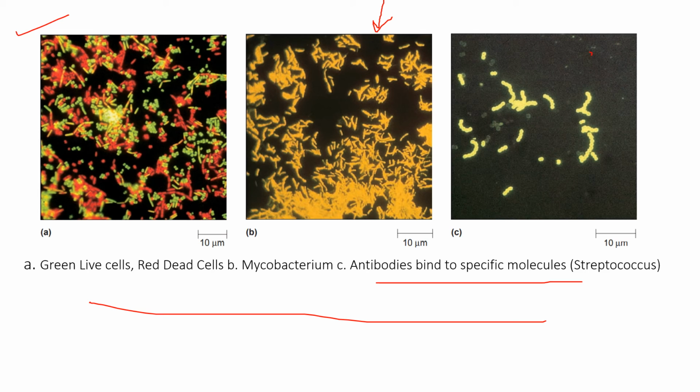You can see that we have a black background and nothing else, only the antibodies which were attached to the antigen are appearing in the ocular lenses, because antibodies are the only molecules in the whole sample which are stained with fluorochrome and nothing else, not even the antigen. It is just that we are ensuring that antibodies, if present in the sample even after washing it, simply mean that antigen is present.